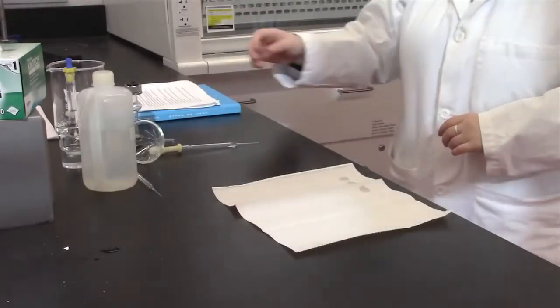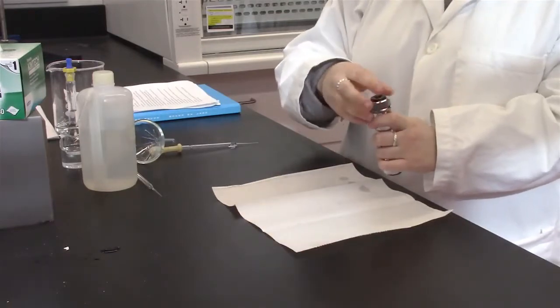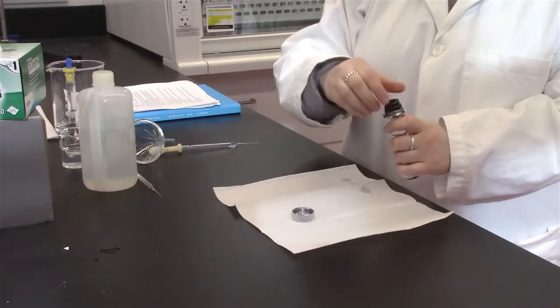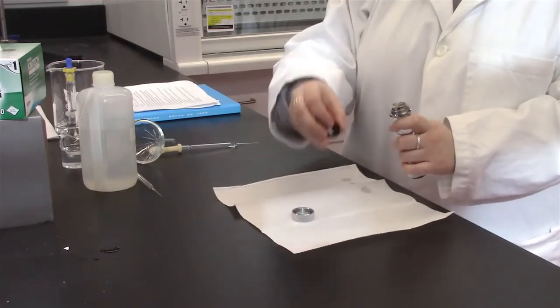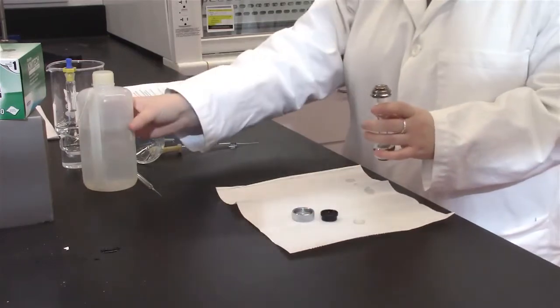Next, ensure that the polarimeter sample holder is clean. Note that there are three sections to the polarimeter sample holder: the silver cap, the black washer, and a clear lens. Be careful not to break the lens.